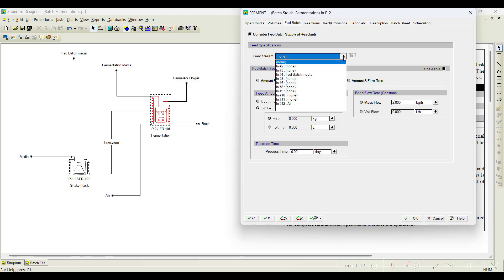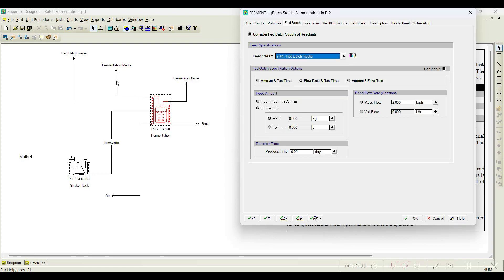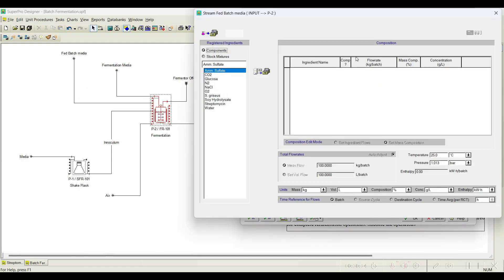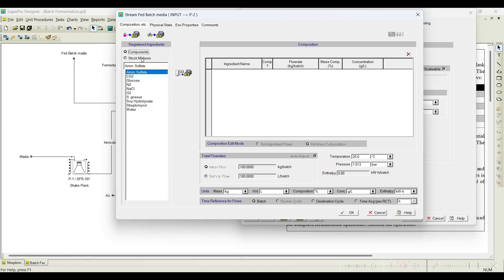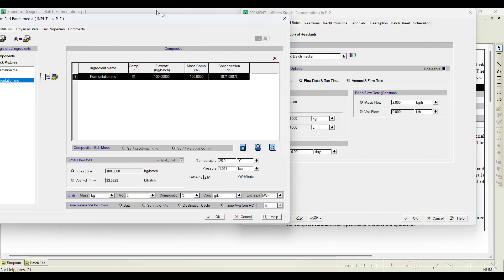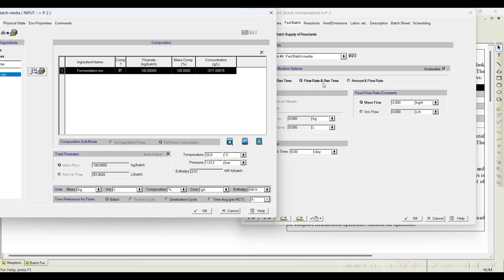Here first we need to select the media — that is the stream, the fed-batch stream. We have not initiated it yet, so that is the reason we need to add the fed-batch media. The fed-batch media composition is the same as fermentation media. We already registered it as a stock mixture. I will select the fermentation media, and since flow rate and reaction time is selected, we set the flow rate; the reaction time is six days. Based on these values the software will automatically calculate the quantity of fed-batch media required and draw from that particular stream — so it is auto-adjusted.